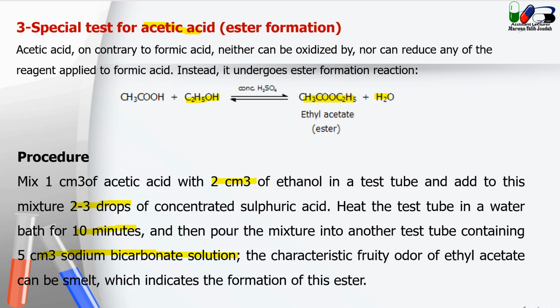But before we even do that, the temperature must be no more than around 50, because over 60 or so, your solvent will be vaporized, and you will end up ruining your final product.